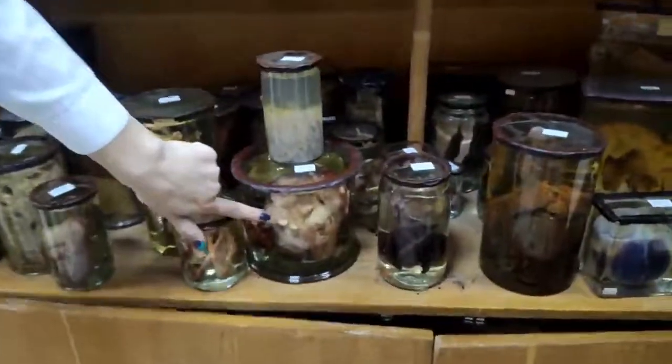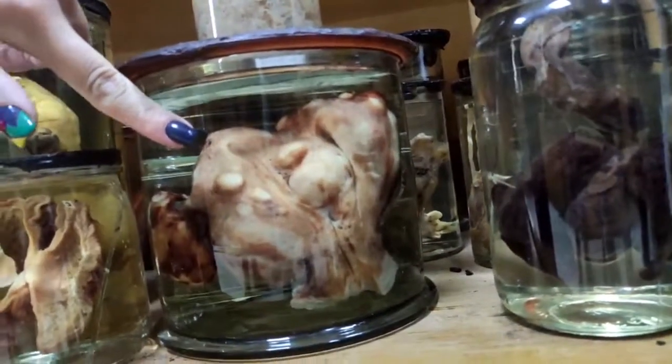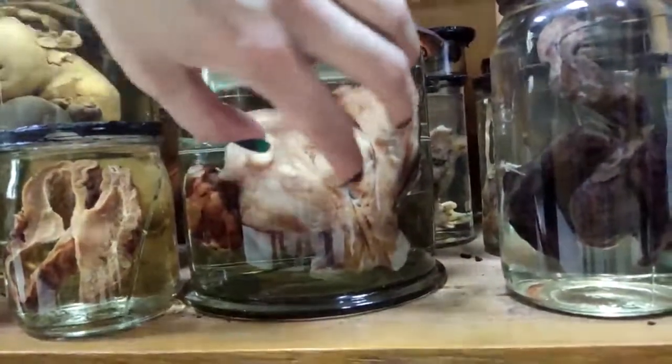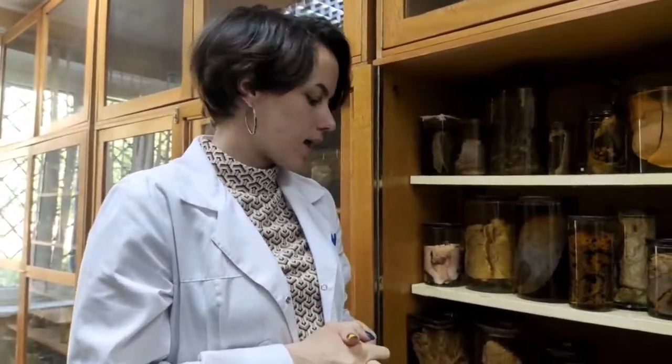Next one is multiple fibromas or leiomyomas in the uterus. Leiomyomatosis is the same. And you can see a lot of nodules. These nodules are benign tumors, leiomyomas. Leiomyoma is a benign tumor of smooth muscle. These tumors are not really dangerous for the woman. They can transform into a malignant tumor very rarely, and most of the time they give other problems.